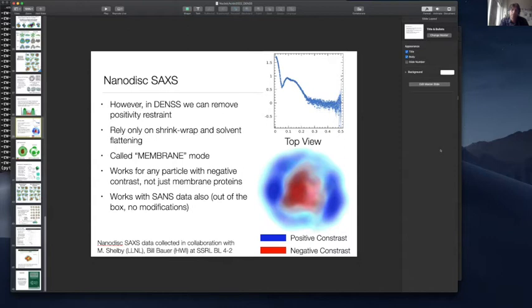It will be interesting to see the fluctuation in cytosol versus chromatin, what is inside, if that's possible, because there are features. It might be a resolution limit, but sure. There are features in both the ultraSAXS and SAXS regions to see the fluctuation, but it's hard to interpret. So if there is some very ab initio reconstruction, it would be really interesting to see if we can see something. Yeah, that'd be great. I'd love to try it.